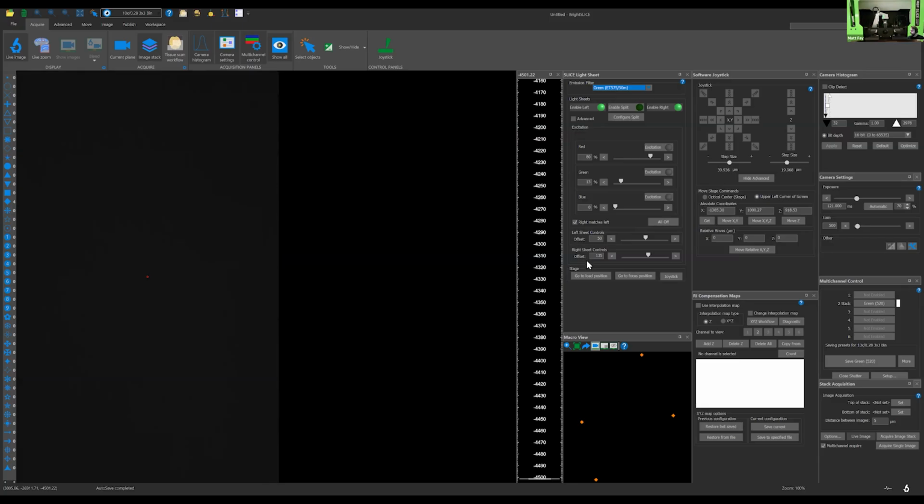So wherever we are in the sample, our detection focal plane may have actually changed its position based on the working distance from that refraction. We're going to move the light sheet to fall in that detection focal plane for that positioning in the sample. We'll then set up a few points of focus throughout the sample and interpolate between those points of focus while we're imaging live and automatically while we're doing the acquisition.